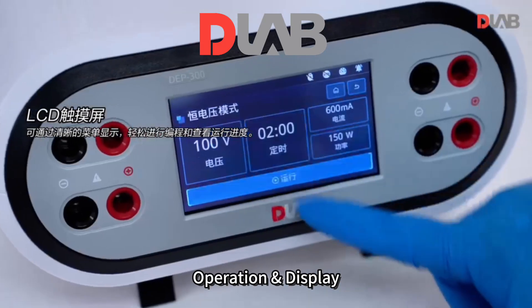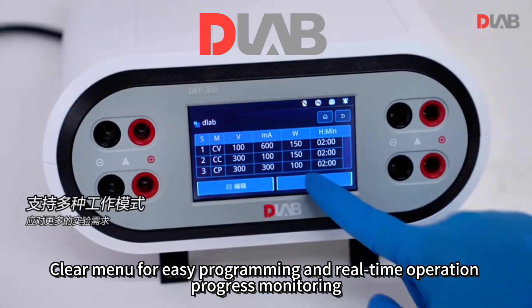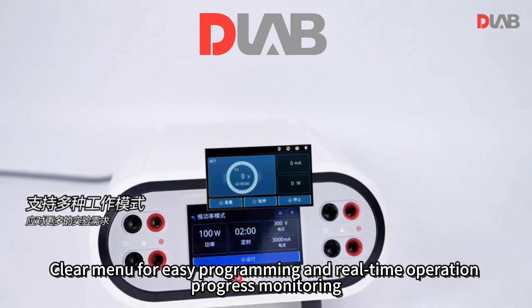Tube operation and display: LCD touch screen with a clear menu for easy programming and real-time operation progress monitoring.